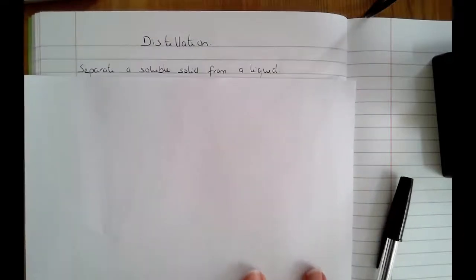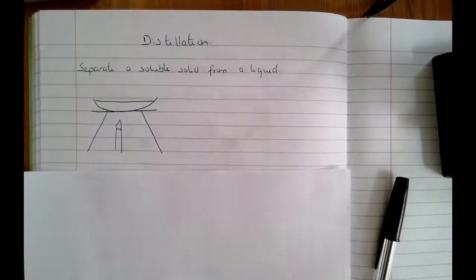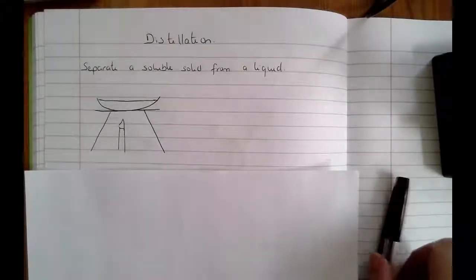So in this video we're going to continue with CC2, which is separating mixtures, and we're going to look at a different technique called distillation. Distillation can be used to separate a soluble solid from a liquid. And if you watched the first video I made on this topic, you might be thinking, well, that's exactly the same as crystallization. We came across crystallization in the last video.